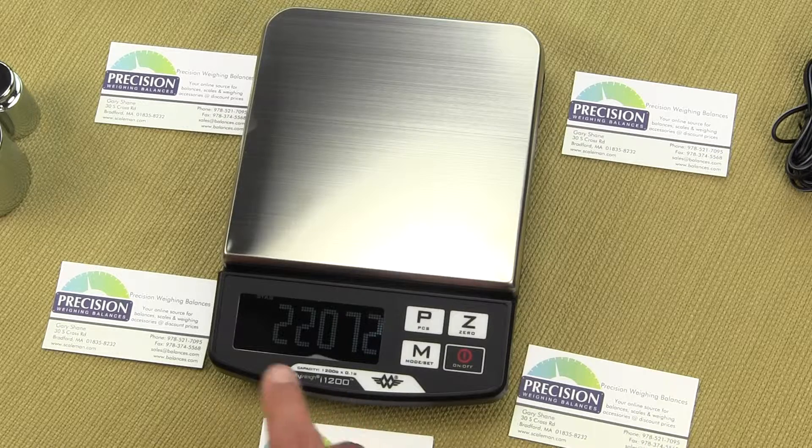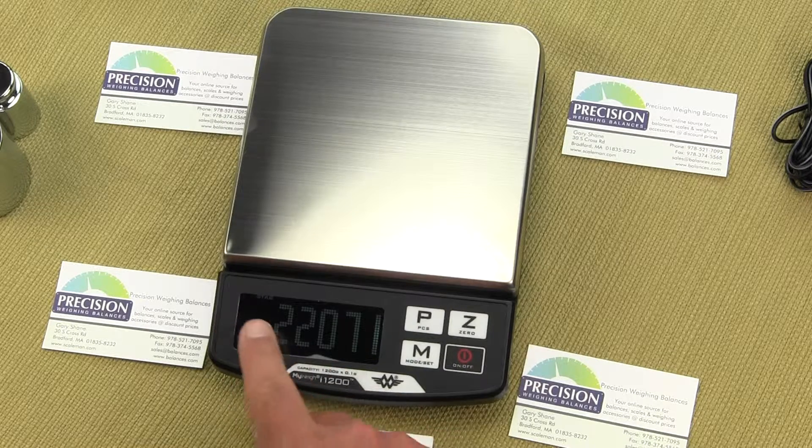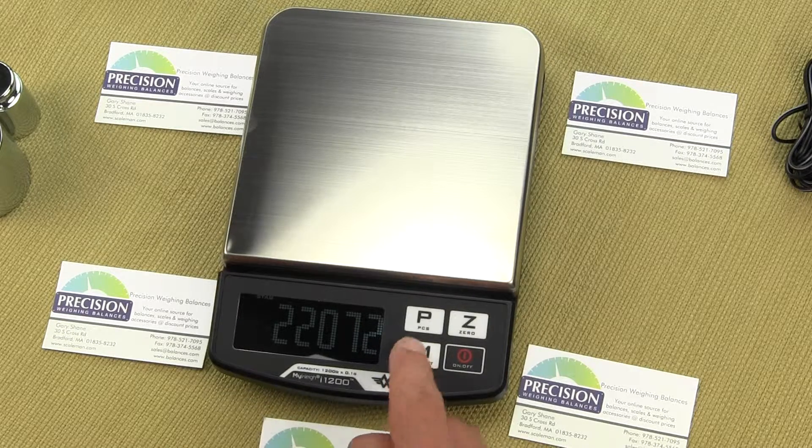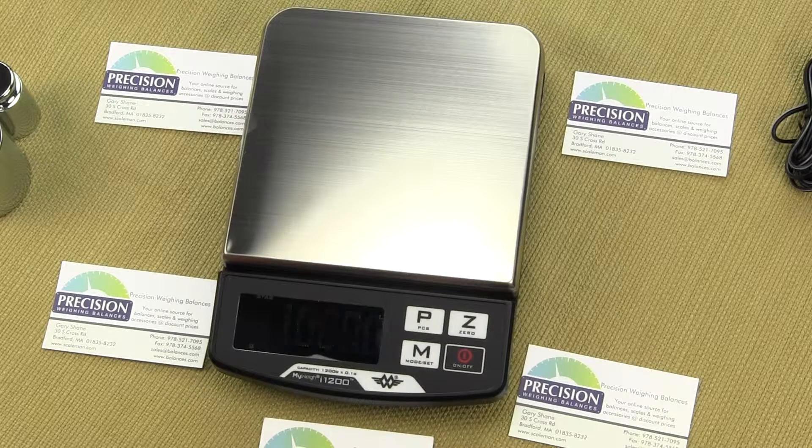Once you see STAB in the upper left-hand corner of the display — that's the stability indicator — press the M key. This stores that zero-weight value in the ADC converter, and now the display is flashing 1000.